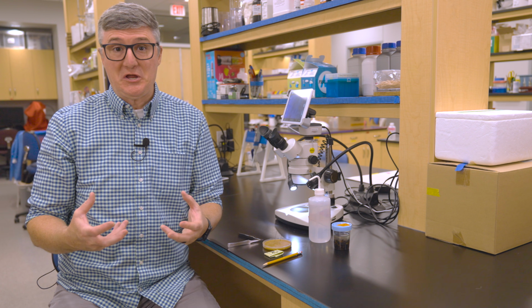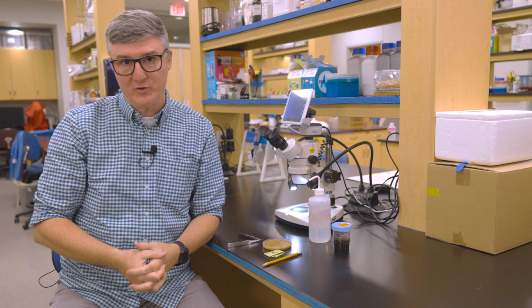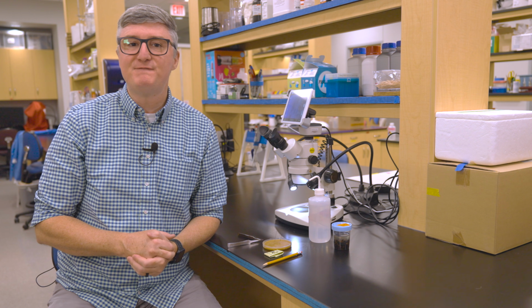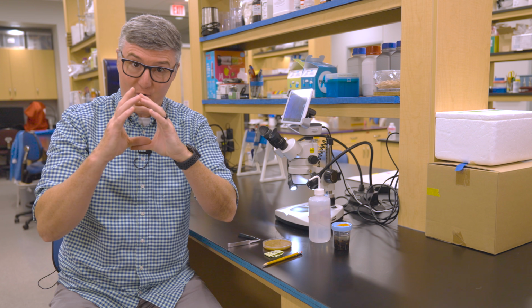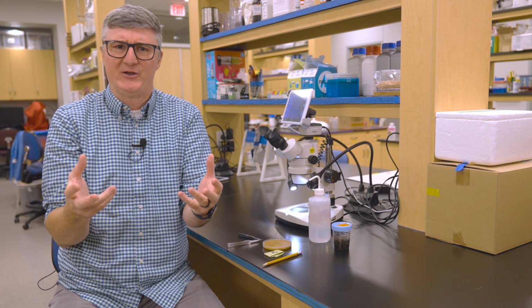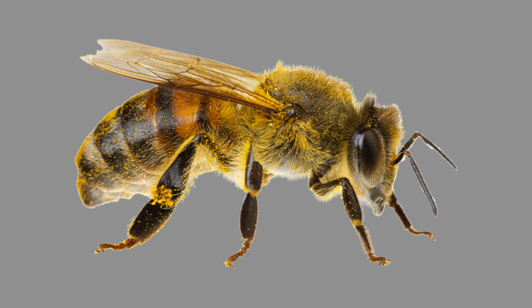We're dissecting for tracheal mites, and fortunately the name of this mite really helps you zero in on where you want to be. You want to be in the tracheal system of the bees. If you remember bee anatomy, bees have a very robust tracheal system in their thoraces. That's the part of the bee that everything that moves the bee attaches to. So think about a standard honeybee. You've got head, thorax, and abdomen. When you look at that thorax, you've got the 4 wings, you've got the 6 legs. So 6 legs and 4 wings are attached to the thorax.